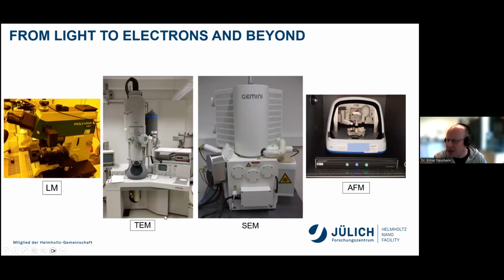Here we have some machines, a light microscope. Everybody knows this is a quite old transmission electron microscope. This does not exist anymore. It was demolished a couple of years ago already.